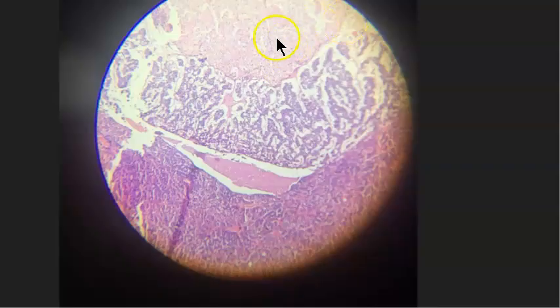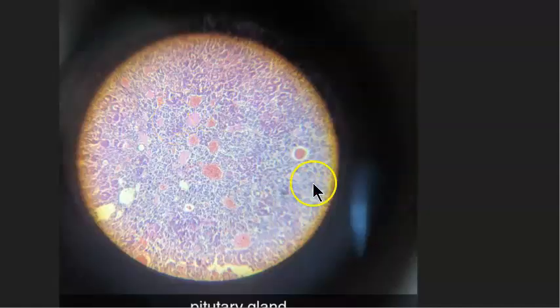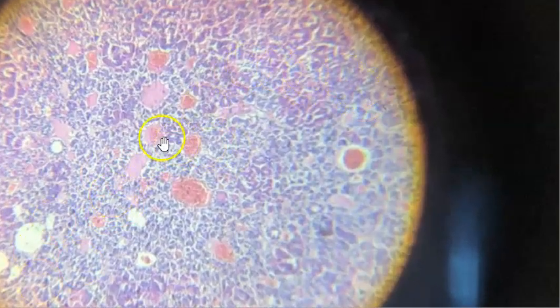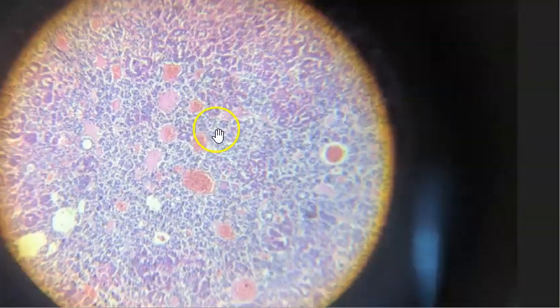Very good. What do you think this is? It's not very clear, but you can see two different things here, right? We'll show you a better photo. Wait. So here you can see many types, right? So you have the posterior pituitary, pars intermedia, is it, in the middle, and then you have the anterior pituitary, right? It's also pituitary gland. Very unique, very beautiful, so many colors. So you have chromophobes, acidophils, basophils, right?